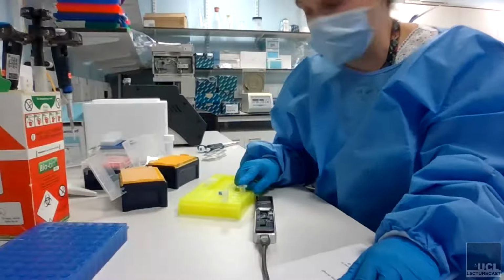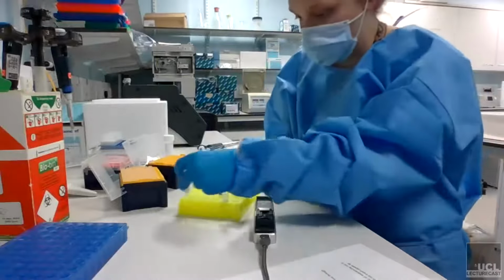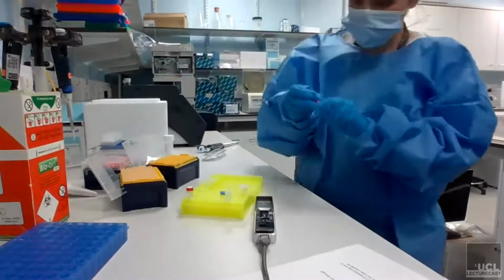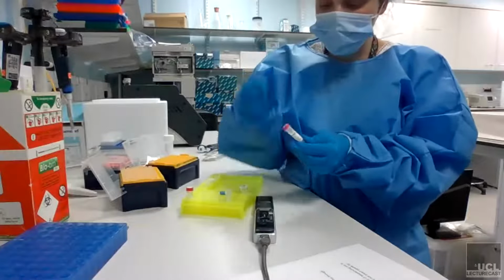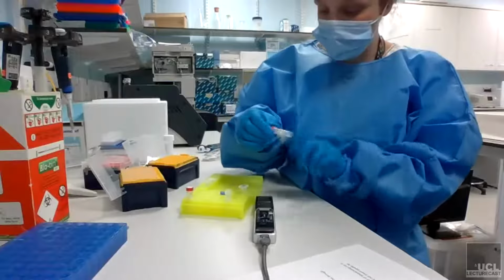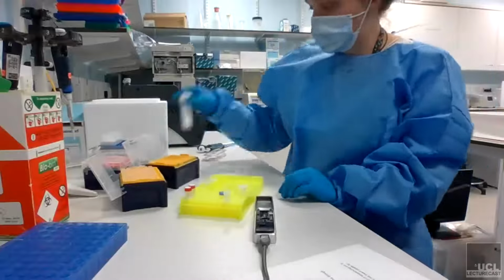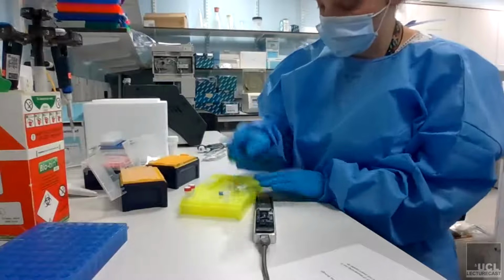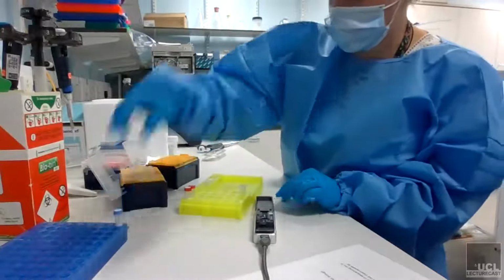So we've got sequencing buffer, which is the red lid tube. We've got loading beads, and it's really important. These have got teeny tiny beads in, so just before you take them out, you give them a good flick, because you want to get them evenly spread. So loading beads. We also need a small amount of water, and then we're going to put it in with our DNA library.